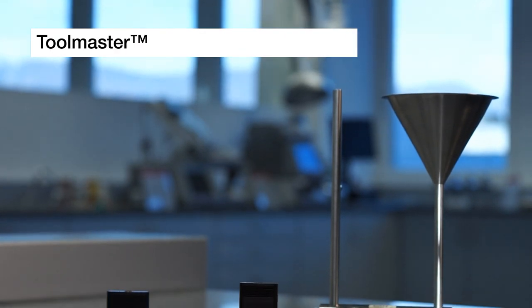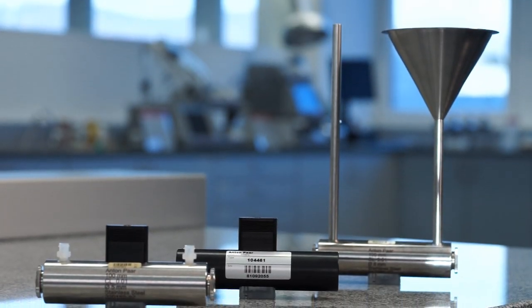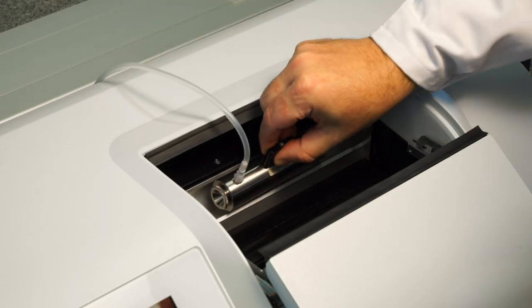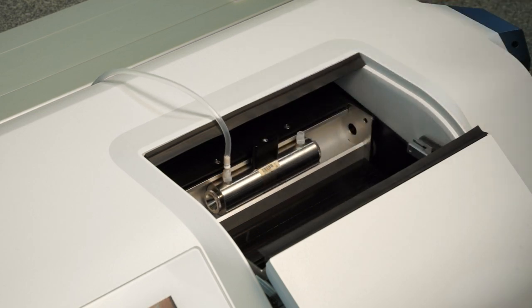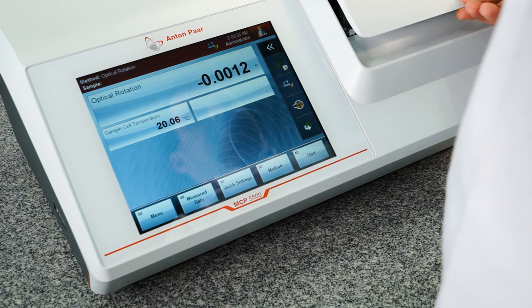The unique Toolmaster technology detects automatically the sample cell being used and checks whether it's the right cell for the measurement concerning mechanical length and material. All data is transferred wirelessly to the instrument. This makes the sample cells waterproofed and easy to handle.